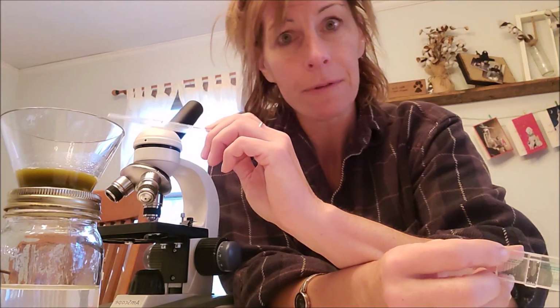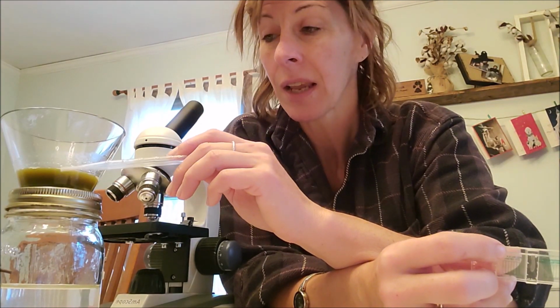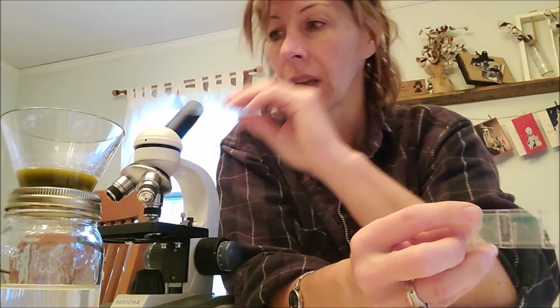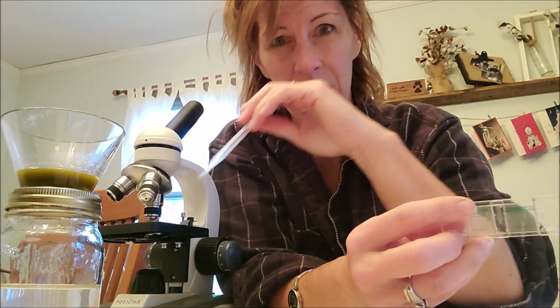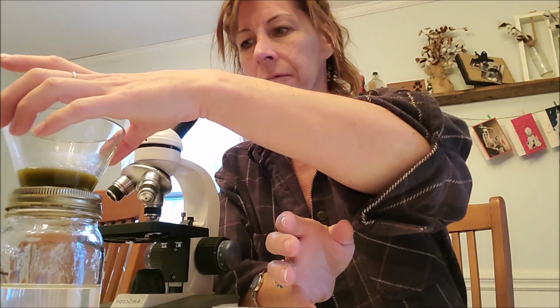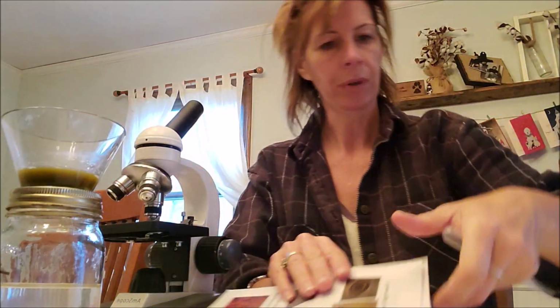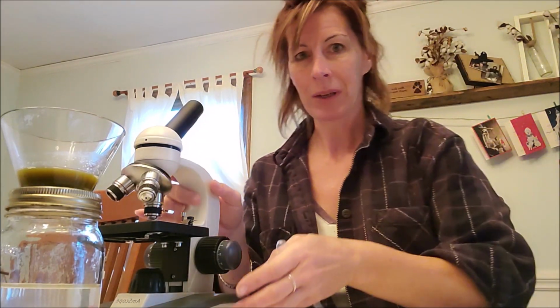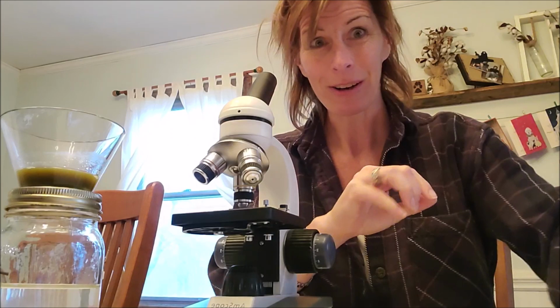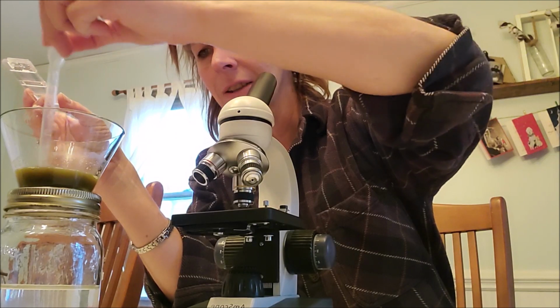So we're going to let this sit for about 5 to 10 minutes. And what happens is it allows the eggs to float to the top. Any more than 30 minutes and the eggs will start to sink again. So we want them to be as much on the top as possible. Okay, so after I cleaned up everything, we're about 4 or 5 minutes, maybe a little longer. So let's put this in here. We'll put this over here. And I have my trusty microscope, which is amazing. And let's give this a little stir, just a little bit.